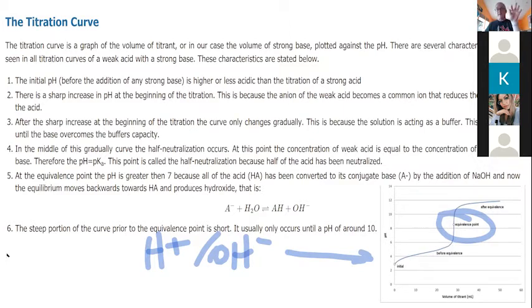And so it's perfect. That's when we want the color to change. If we were titrating a weak base against a strong acid, we would want a different indicator, one that changed colors at like pH 5 or one that changed colors at pH 11. But in this instance, we want it at pH 9, and that's exactly where it changes color. So it's super important to remember to add that, or we'll just keep adding hydroxide and nothing's going to happen.